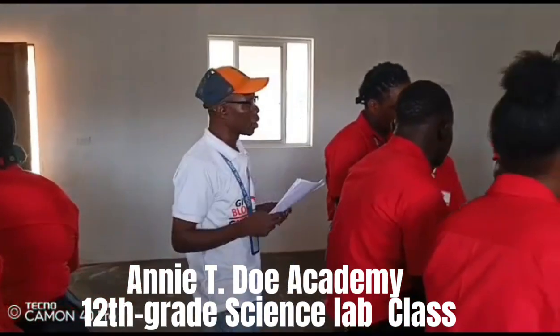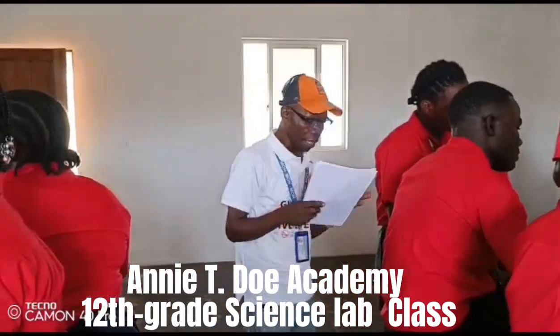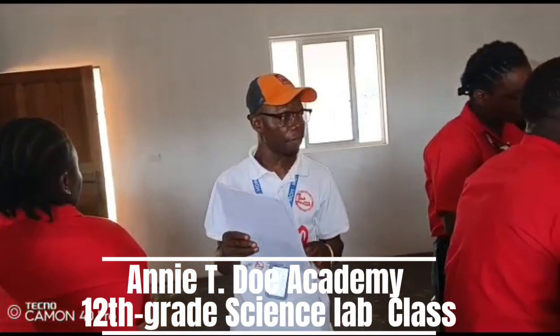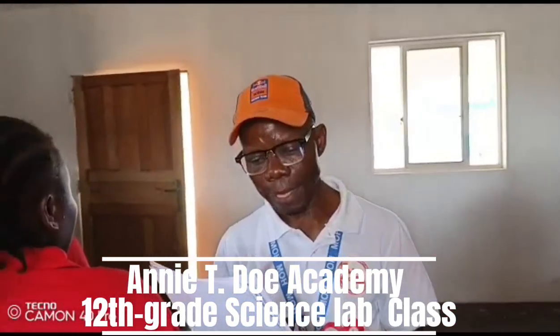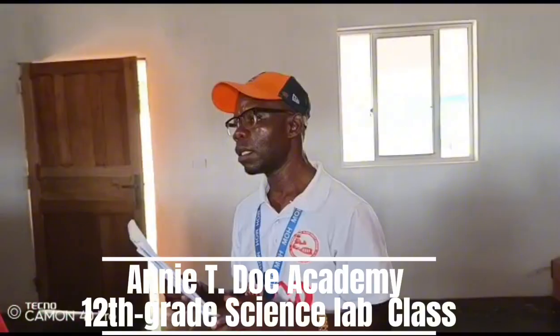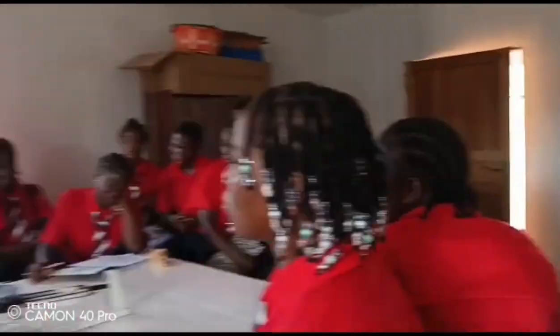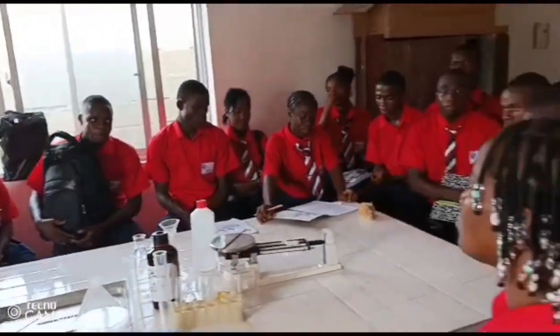What kind of lab are we conducting? Biology lab. And the title for the lab for today: testing for starch in food substances. Then the objective: what is the objective of this experiment? To understand the presence of starch in food substances. Very good.